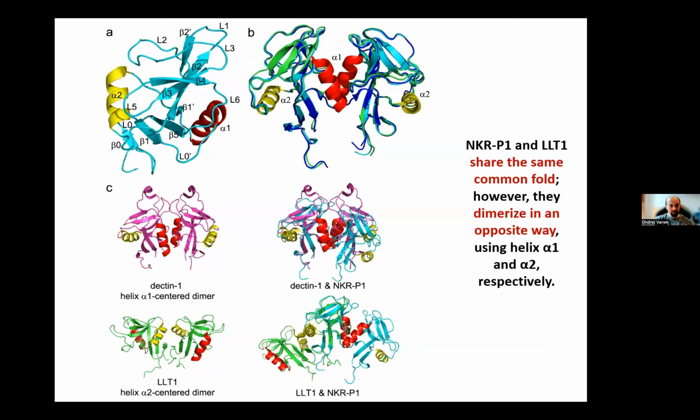So coming back to the structures, what we have learned. On this figure, you see the structure of NKRP1 monomer and then the dimer. So this receptor is also forming a dimer. It should on the cell membrane, but with our soluble ectodomain, we were expecting that it could form maybe a non-covalent dimer, although in solution we always see just the monomer by various techniques. I will show you as well later.